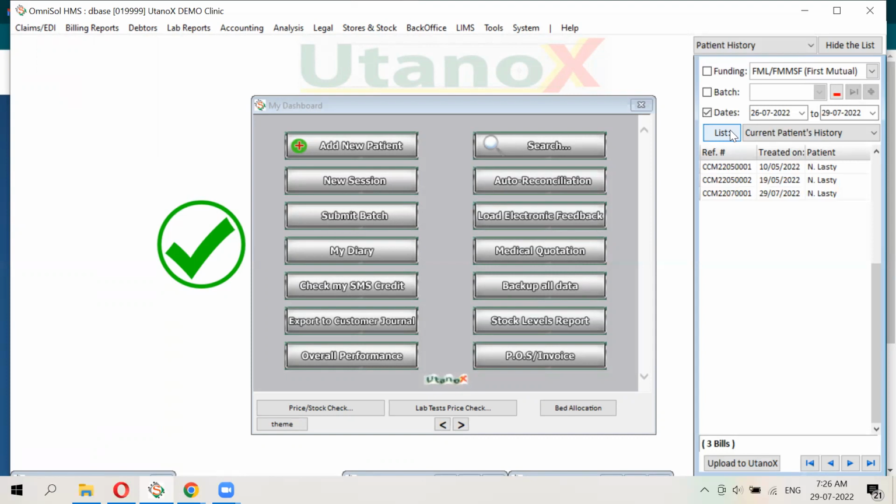The next question is, for example, I have a main lab, let's say in Bulawayo, and then I have another one in Harare. I have another one in Kwekwe. I want these to be linked such that if a sample is registered in Harare or in Kwekwe or anywhere, the database is kept the same. They're all kept under the same database. Not that Harare has got their own, Kwekwe their own. Is it possible to connect this?